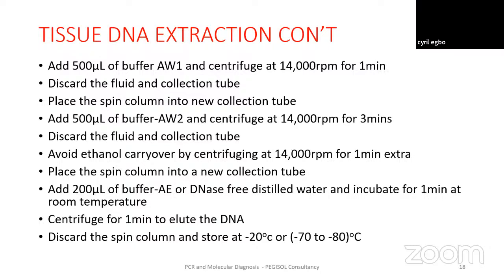Then after elution, you either store your eluate or you analyze your DNA templates immediately. So this is how to extract DNA from tissue and also blood.